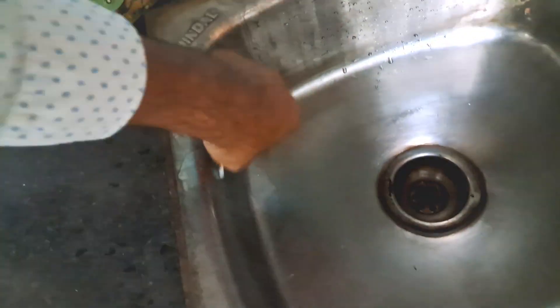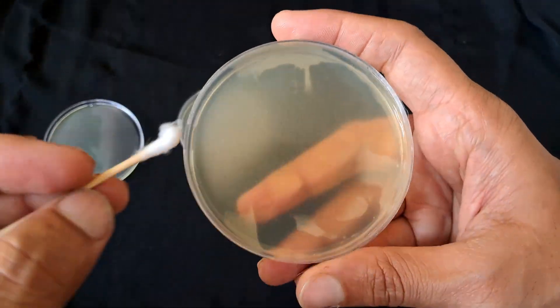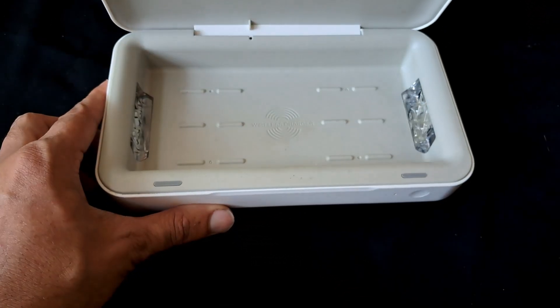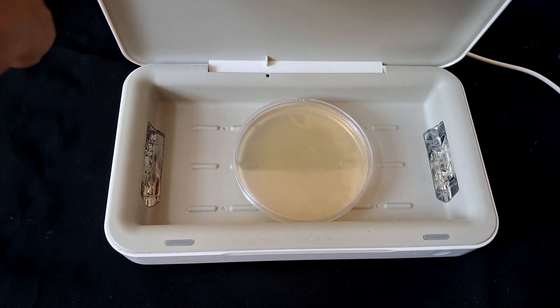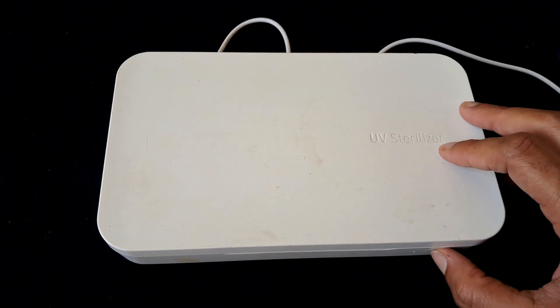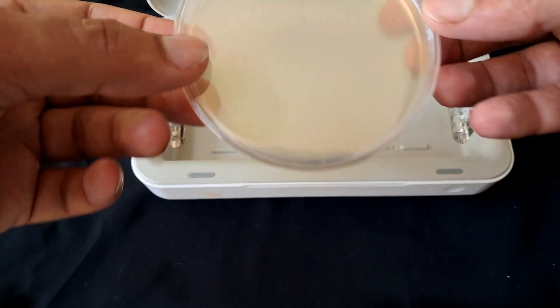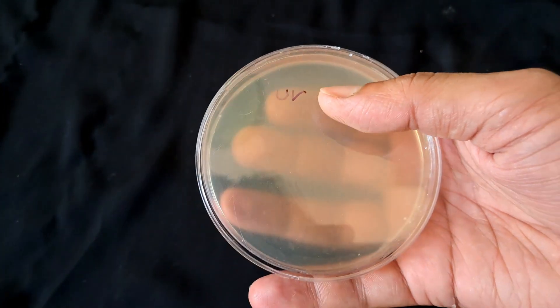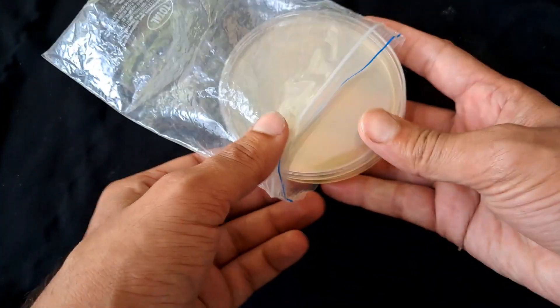Now we can stick the bacteria taken from the kitchen sink onto the new plates. Now begins the UV sterilization process. This time the dishes are the same size, so we will have to mark them. If you have more samples, it's better to mark at the bottom of the dish. I will put them in an airtight bag to avoid any further contamination.